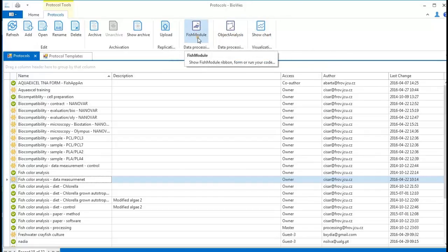Each module is a specific software which can read your data. So the module has to know the structure of your data, and then, similarly to the plugin, we can implement a piece of code to process your data. Again, we have the open interface you can use, and you can create your own module for data processing.